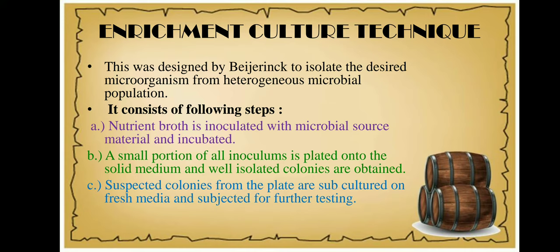I will take a small amount of this culture from the nutrient broth and inoculate it onto a solid medium which also contains cellulose powder. Only the organisms producing the enzyme cellulase will grow in the nutrient broth and on the cellulose-containing solid medium, since I have enriched the culture with cellulose powder.